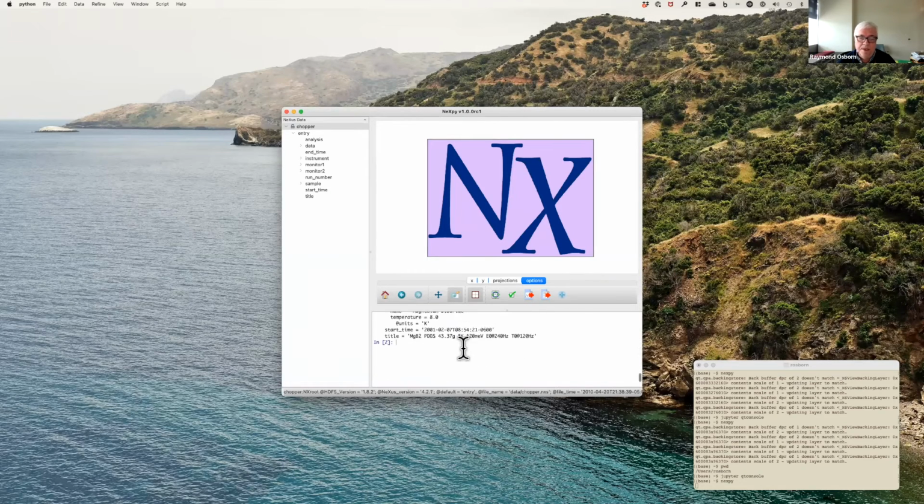Okay, and I can access, in fact, we share the same history, or at least I do. I don't know if it's automatic, but if I wanted to access, well, let's not go there.